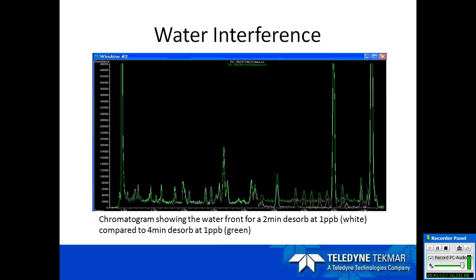This data has just been done recently by Tyler on the Stratum. We had several requests coming in, primarily from the East Coast, looking for 2 minute desorb versus 4 minute desorb and what the differences are between the two. So some of this data has just been recently run within the last 3 weeks, and this was done on a Stratum. So I just wanted to let you know, it's one of the newer systems.